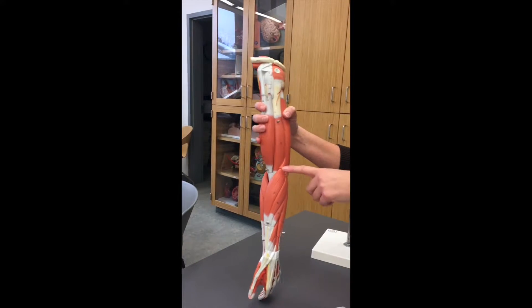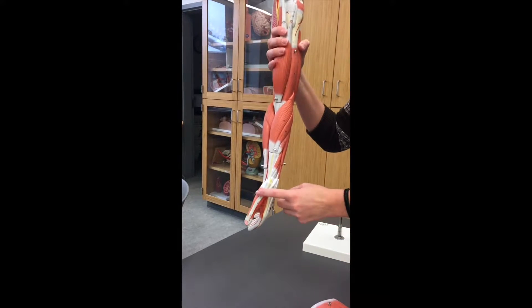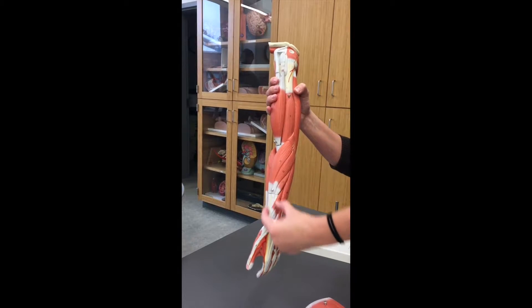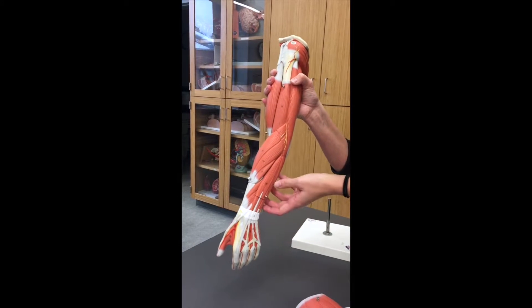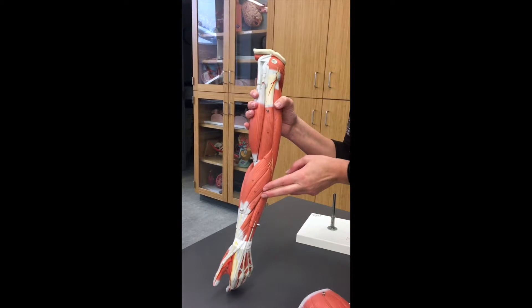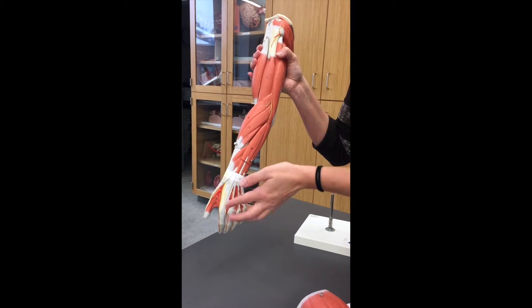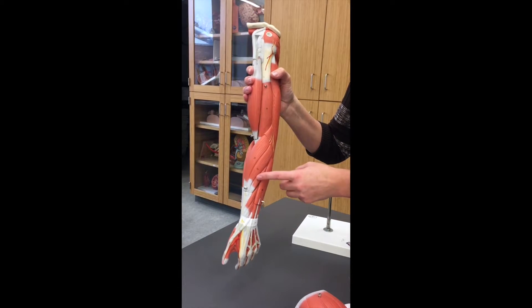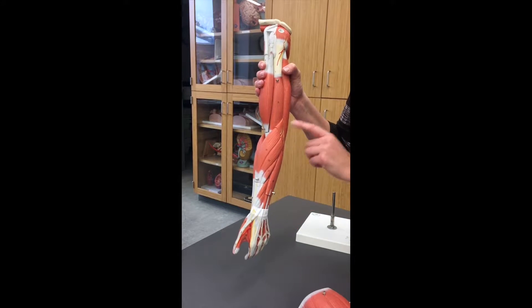Moving down into the forearm, this first muscle goes from the brachial part of your arm and wraps around and goes to your thumb — it's going to be your brachioradialis. The bone on the thumb side is the radius, and the bone on the pinky side is going to be the ulna. So these ones are radialis muscles and these are ulnaris muscles. If you're on the back side of the arm — the back of your hand — these are all going to be extensors. These two guys here are going to be extensor carpi radialis because they're on the back of the arm and they go to the thumb.